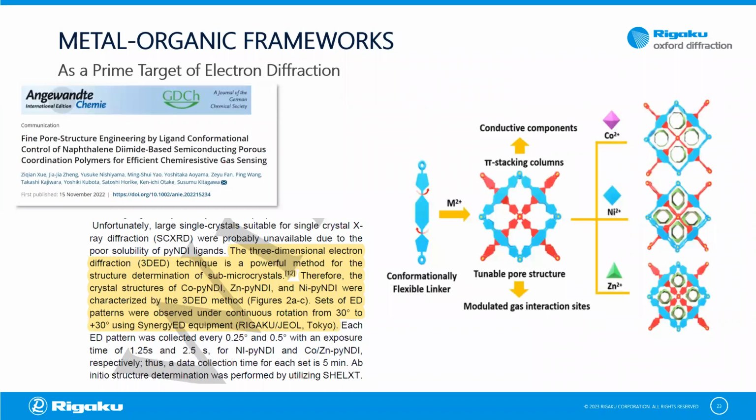Next up is this publication on metal organic frameworks from the Kitagawa group. They exchanged the cation for this framework here, and kept this ligand linker, thus tweaking the ligand orientation and subsequently changing the pore structure and also the gas interaction of this kind of MOF.